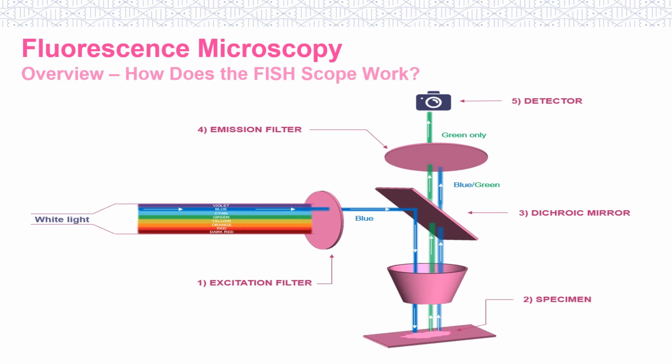A fluorescence microscope is an optical microscope that functions on the simple phenomenon of fluorescence. This is when a specimen is illuminated with a specific wavelength of light, which is then absorbed by the fluorophores hybridized during the FISH setup process, and then, in turn, emits light of longer wavelengths. That is, light of a different color to the absorbed light. The illuminated light is separated from the much weaker emitted fluorescence through a spectral emission filter.